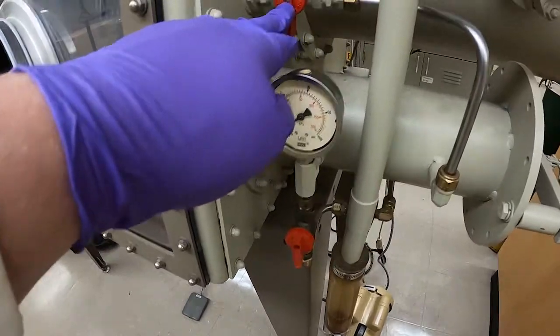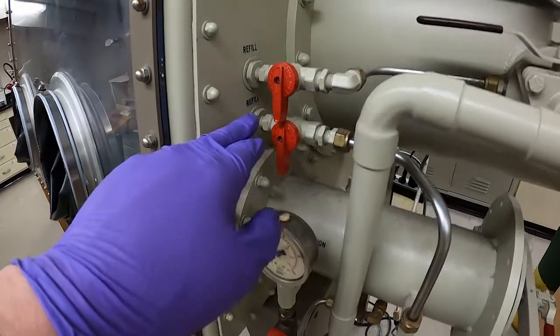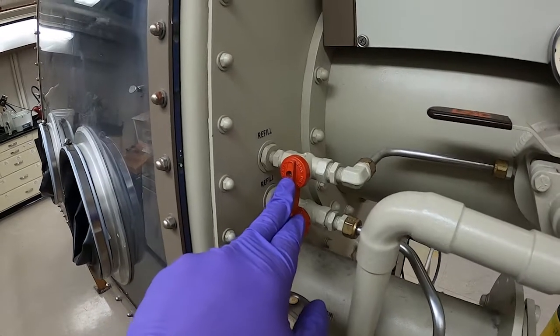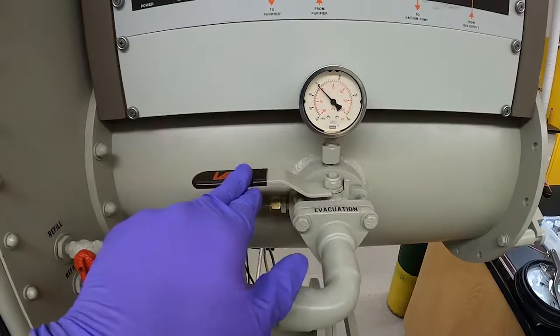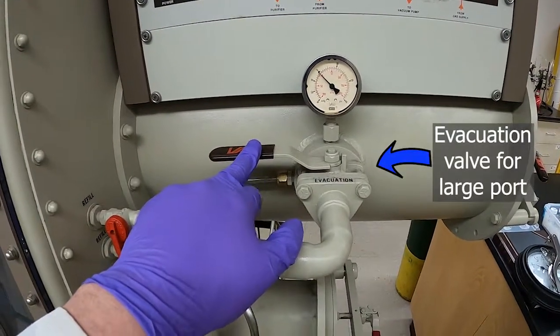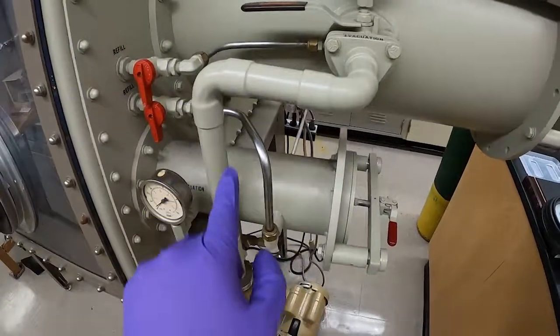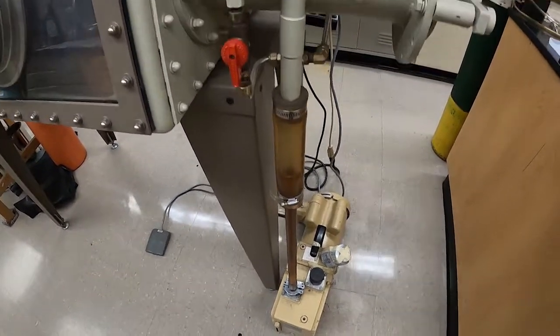Here's the refill valve for the small antechamber, and here's the refill valve for the large antechamber, along with the evacuation valves. The back valve connects to the vacuum pump — you can see this tube being followed to the vacuum pump.